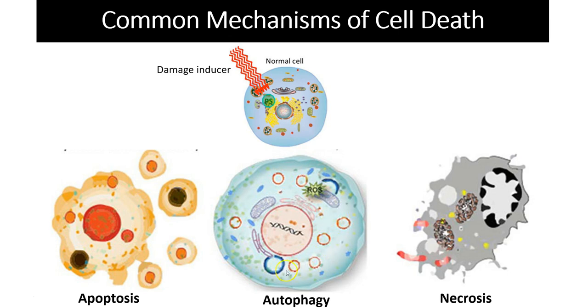So you will see these vacuoles forming, and then eventually the cell will shrink to a point of no return where there's just the nucleus and the cell membrane. Or it could go through necrosis, where the membrane permeability is damaged, there's an influx of fluid, and large vacuoles form, the nucleus gets destroyed, and eventually the cell bursts. This is a very explosive death. It damages other cells, even normal typical cells around it, as a result.